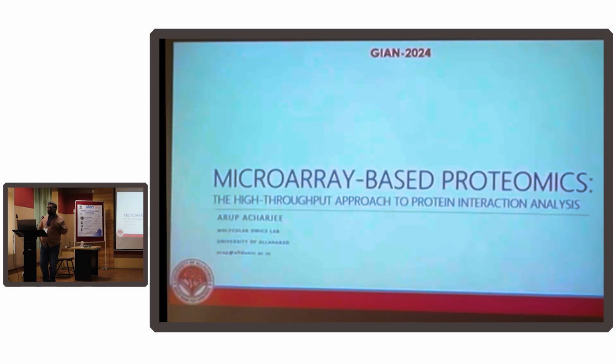Like, it's a test that can be done by a layman, a test that can be as easy as those lateral flow tests that you use, like for COVID we had used one, pregnancy testing kits. So something as easy that can be done at home or maybe done at a very rural dispensary. That's what we aim at as a scientist. So one way of doing it is by microarrays.